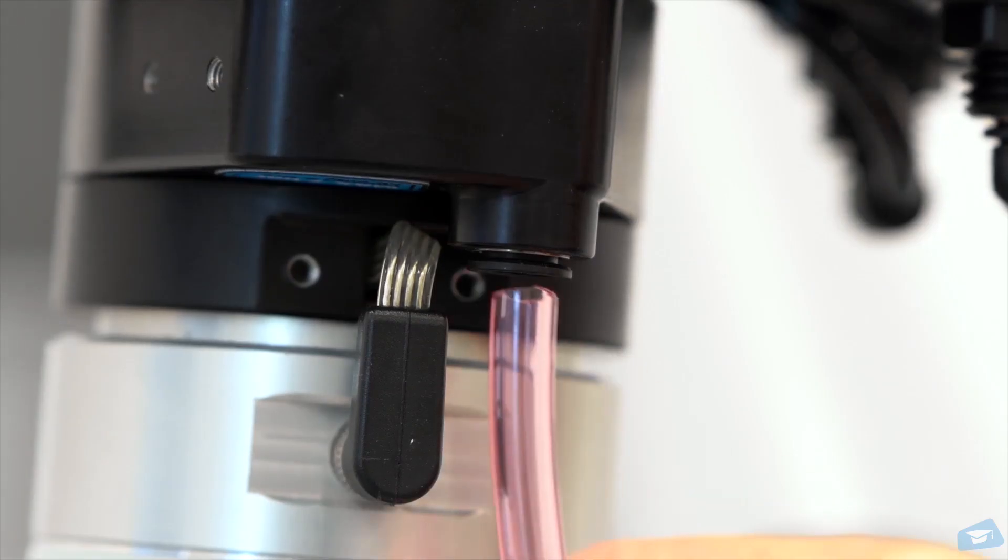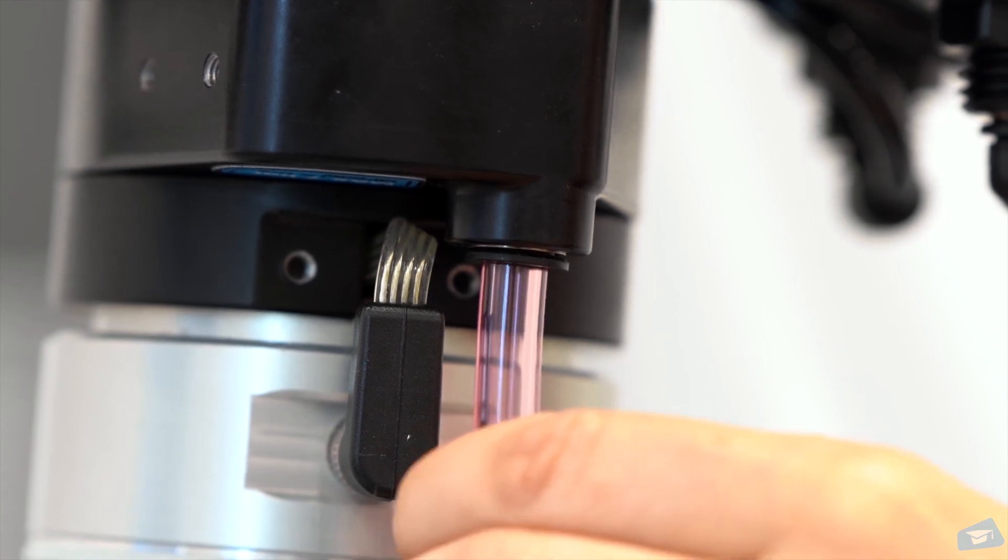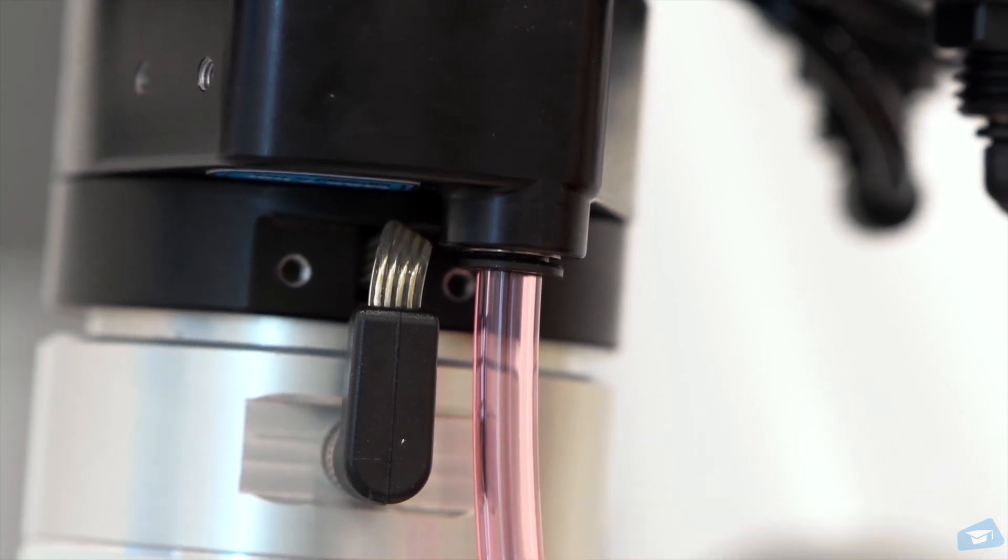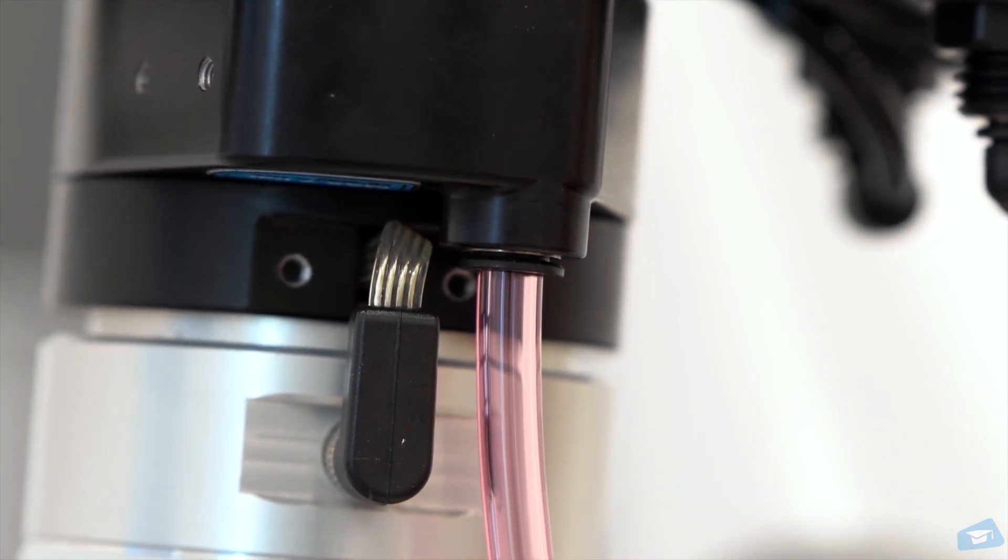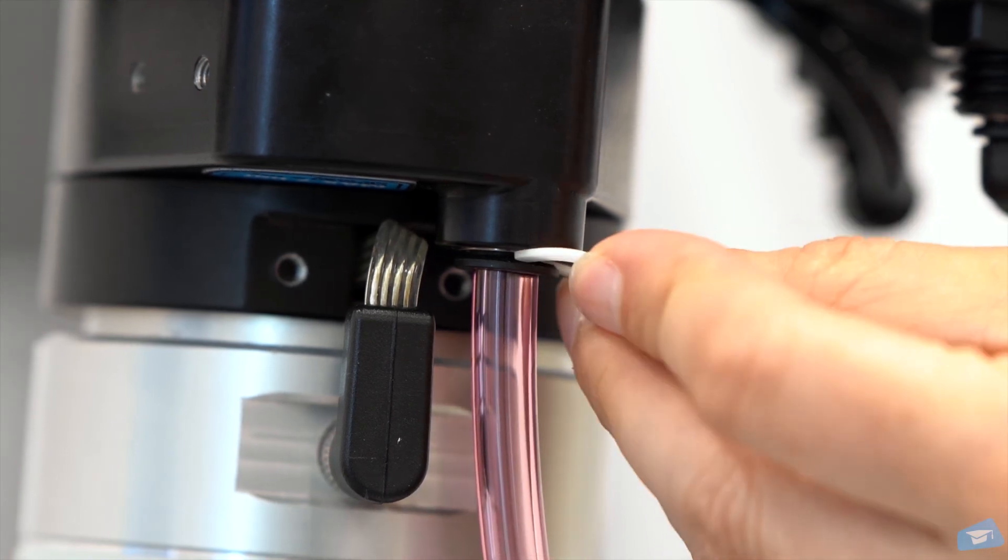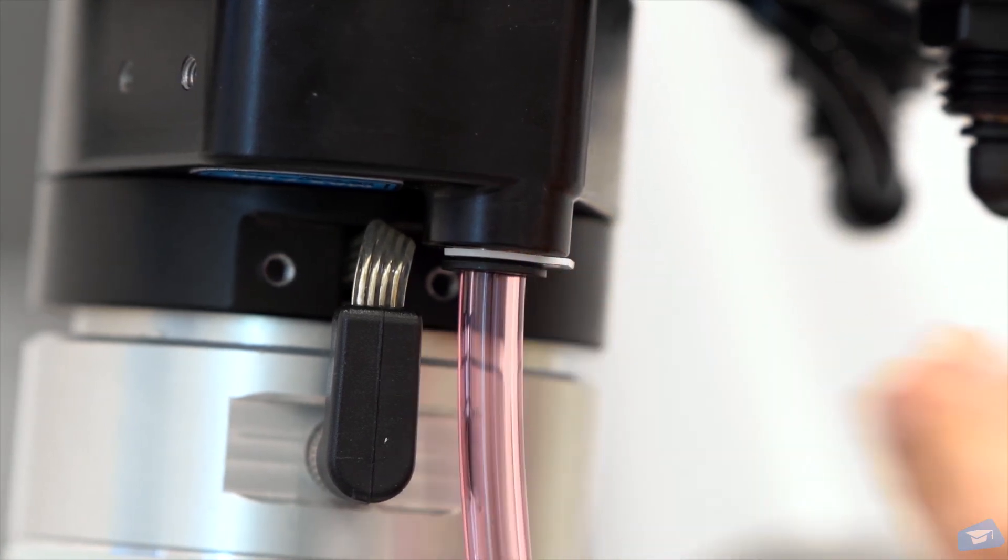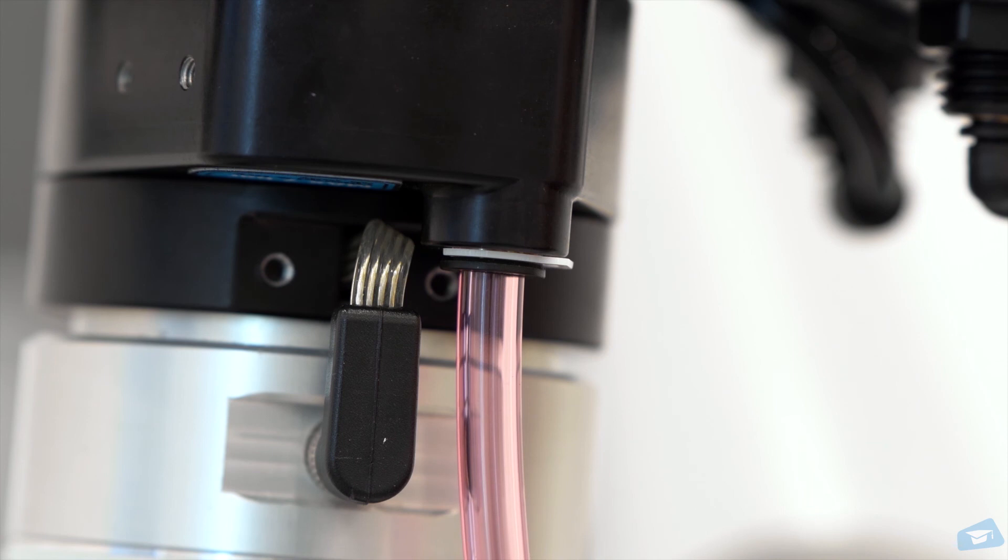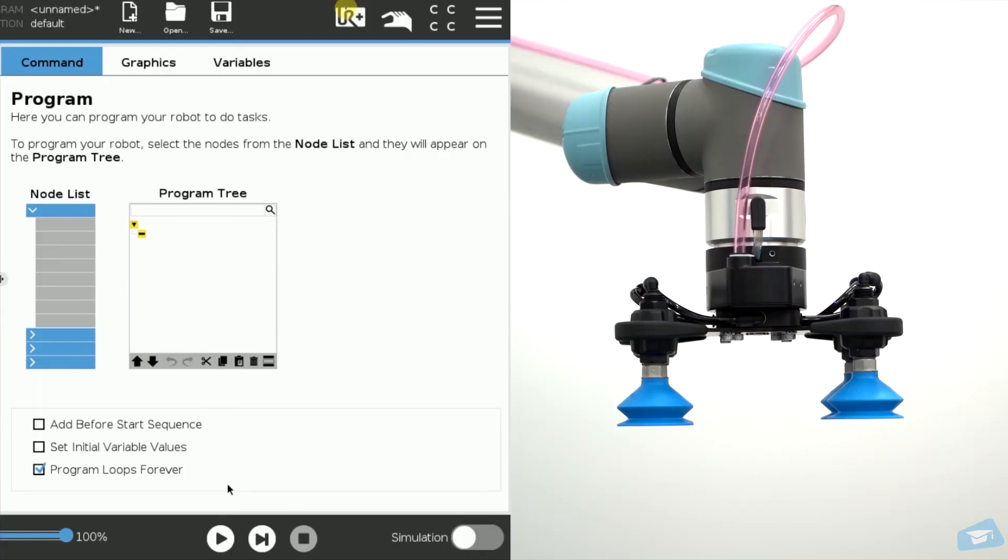Plug an air tube from your compressed air supply line to the vacuum gripper. Note that the vacuum gripper only fits an 8mm or 5/16-inch air tube. To secure the air tube, install the safety clip at the appropriate place.